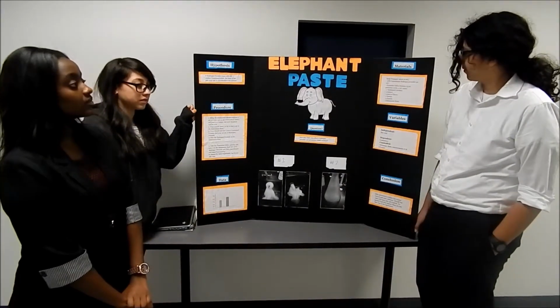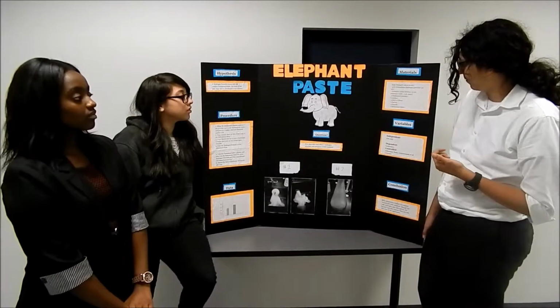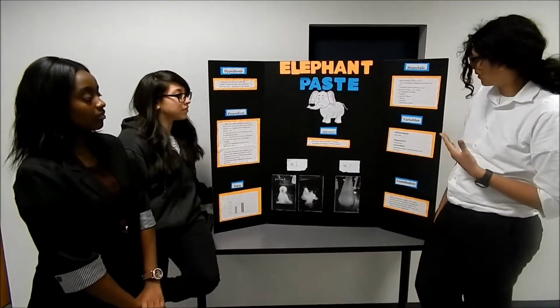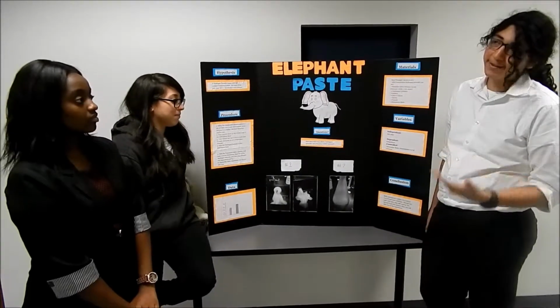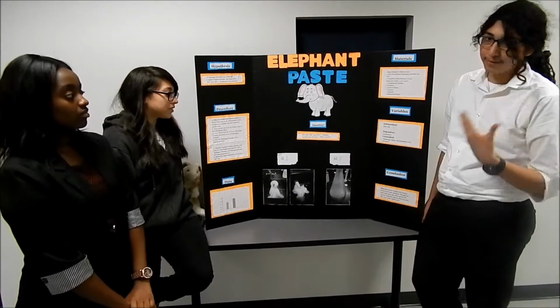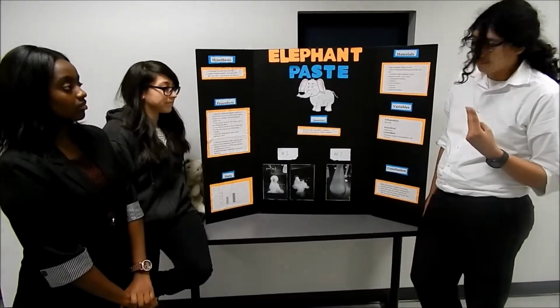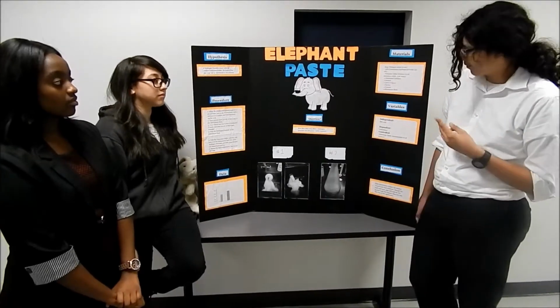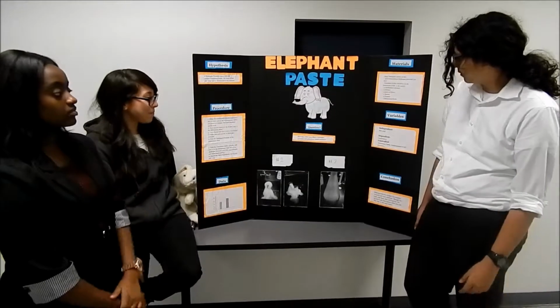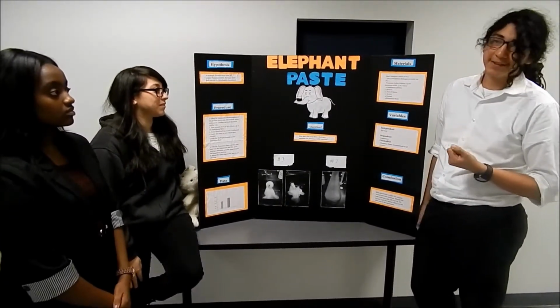Right, so the materials we used were soap detergent, which was about 10 milliliters of it, concentrated, 30% concentrated hydrogen peroxide, and that was about 40 milliliters of it. Potassium iodine solution, which was 15 milliliters of it. 4 graduated cylinders, 2 beakers, 4 pairs of gloves, spoons, funnels, and Erlenmeyer flasks.